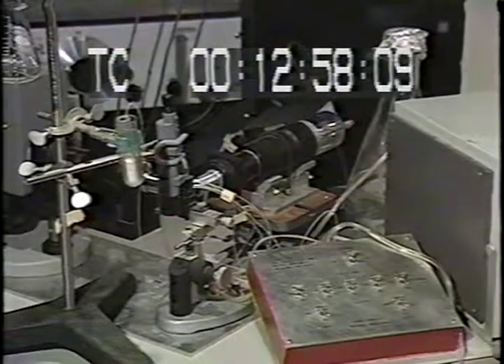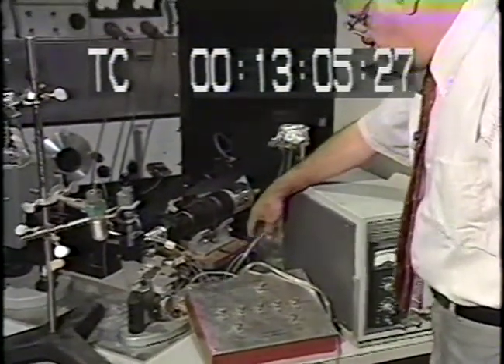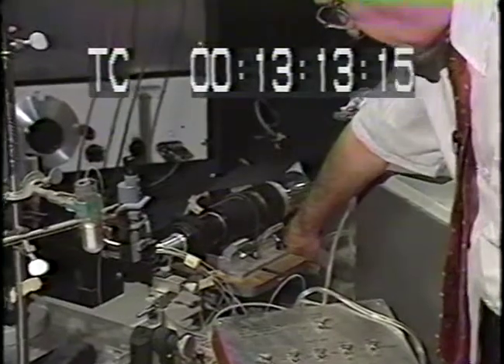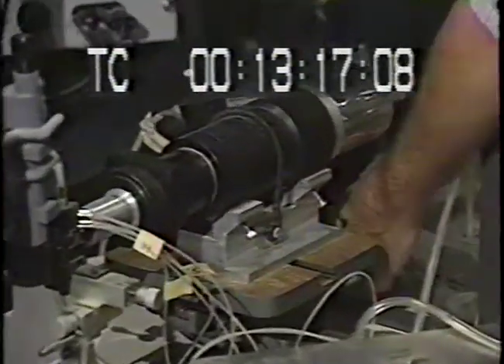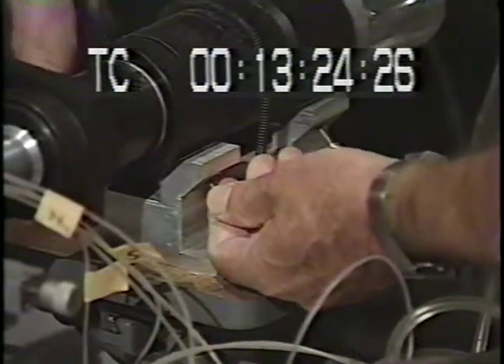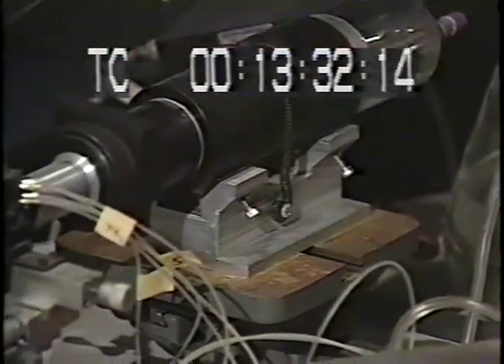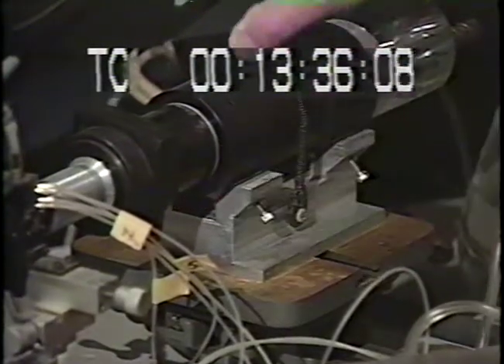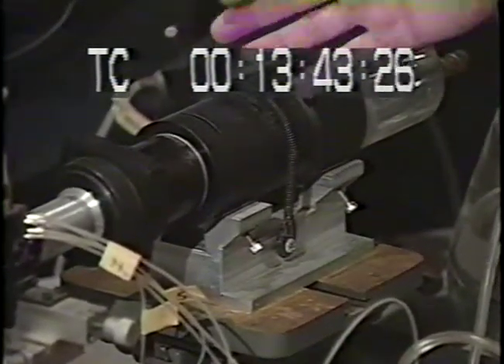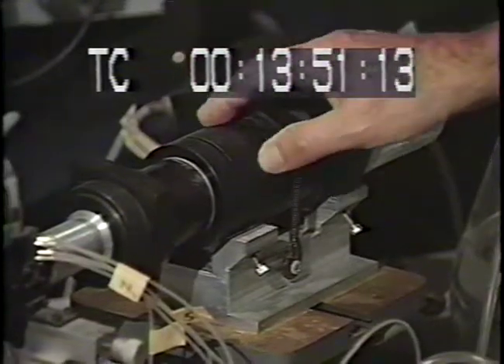Now, what is the photomultiplier and the lens resting on? It doesn't look like standard laboratory equipment. No, this I think must have been an old lathe, an adaptation of the lathe. It has an up and down crude movement here in the back, and then has screws that allow you to move up and down and sideways. And as you can see, everything is very loose. But as a working model, it's a very useful instrument because it allows you to move everything. So I understand why this prototype was built in this way.